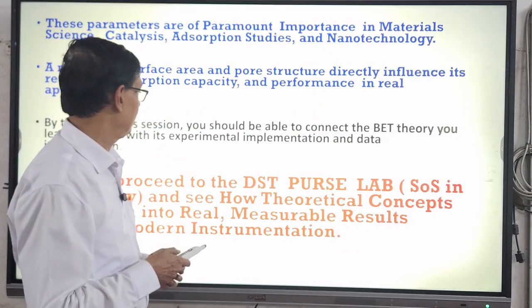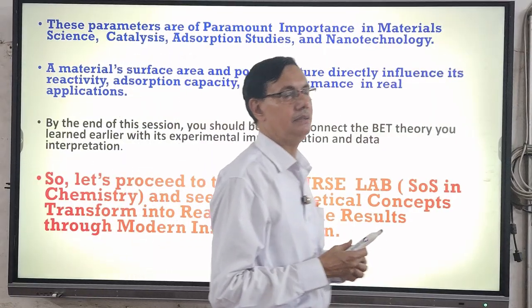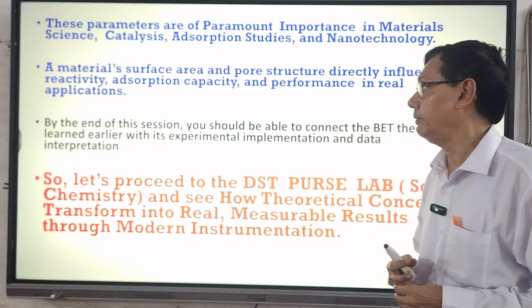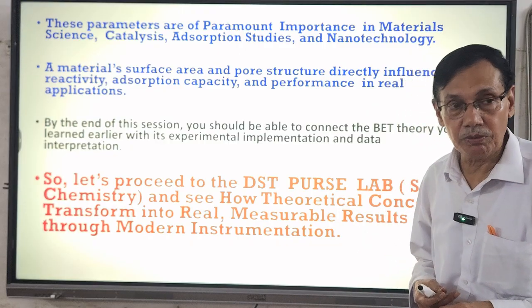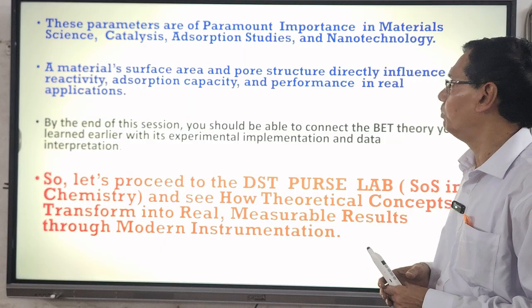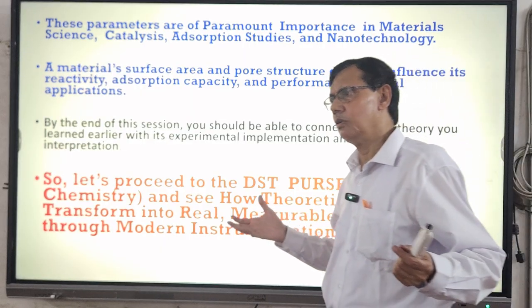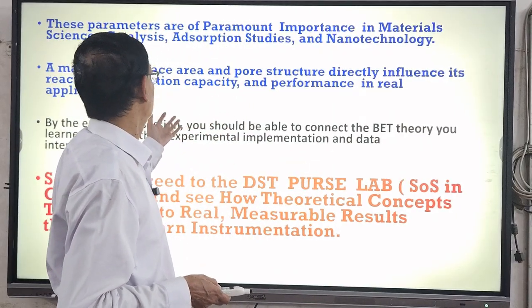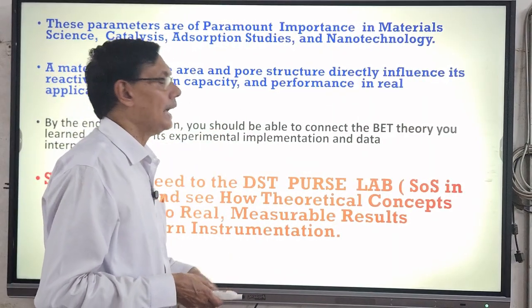I am really grateful to Professor Manas Kanti Deb, Professor Shams Parvez, and Professor D.P. Bisen for giving me the opportunity to use this very sophisticated equipment. It has paramount importance in the area of environmental science, material science, pharmaceutical science, as well as nanotechnology.